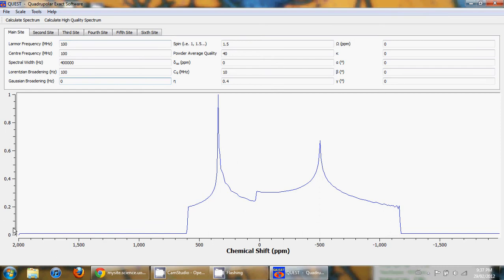The default spectrum contains 500 data points. That is the default number of data points in Quest. This is for speed.